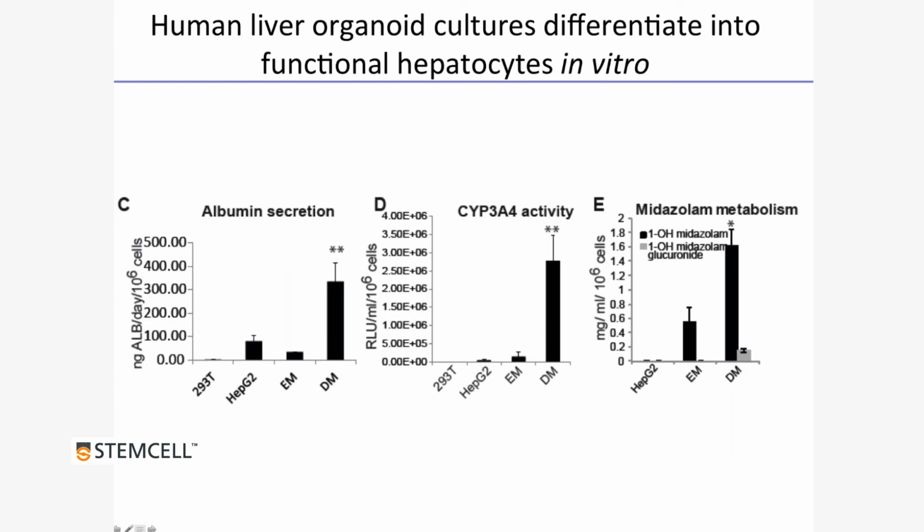Nevertheless, when we looked at the other functional assays, we observed that cytochrome activity was again very similar to what we would have in fresh isolated hepatocytes, which are not plotted in this graph because it was not done in the same experiment, and they also, for instance, could metabolize some drugs like midazolam.